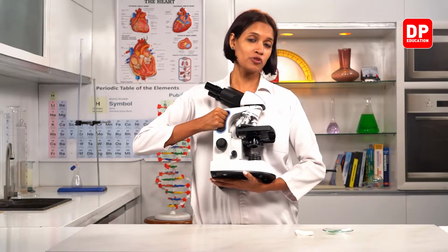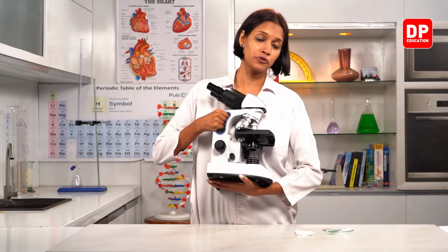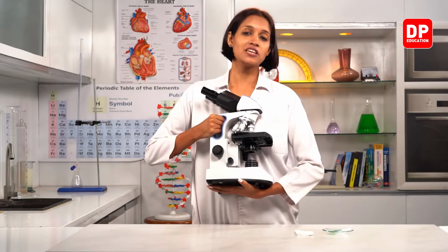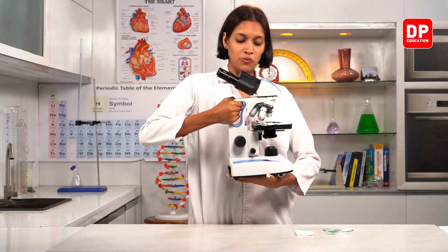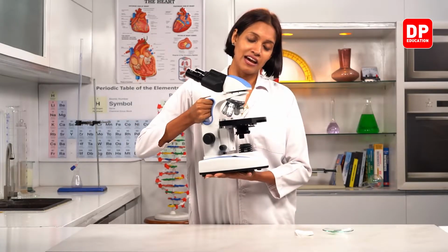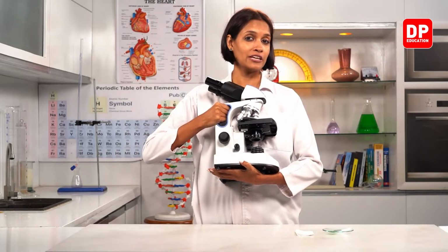So by doing this, we can make sure it will not fall off. We are not going to drop it even accidentally, right? So this is how we are going to carry it, with both hands, the dominant hand on the handle, the other hand under the base, and then you hold it towards your body like this.